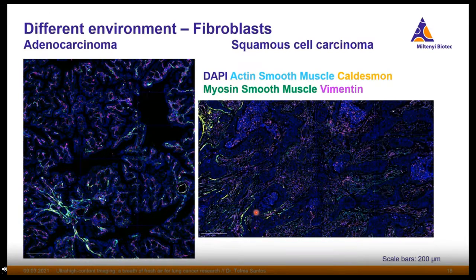When I say activation, it is normally in favor of the tumor, against infiltration of immune cells. So that's not very good for prognosis. We can see that in this area, which coincidentally we know has some infiltration from the other images, it can be a reaction of tumor cells to prevent infiltration from going further. And interestingly, these activation areas are at the border between the tumor cells and the stroma area, so it could be supporting the growth of the tumor cells.